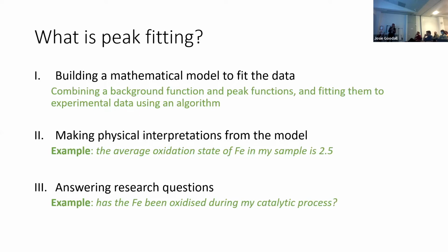An example of a physical interpretation you might make: the average oxidation state of iron in my sample is 2.5. That might be an interpretation you make from your XPS fitting. And the research question that might answer, I don't really know much about catalysis, but I'd guess a catalysis question: has the iron been oxidized during my catalytic process? Does that sound sensible? Yes.